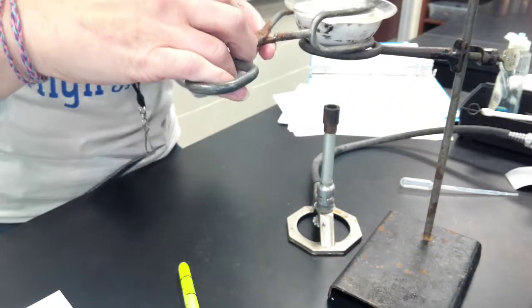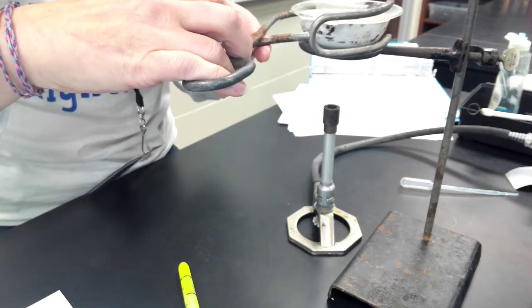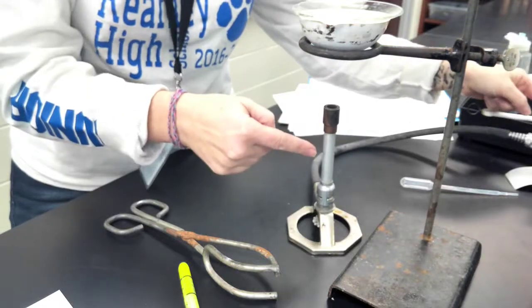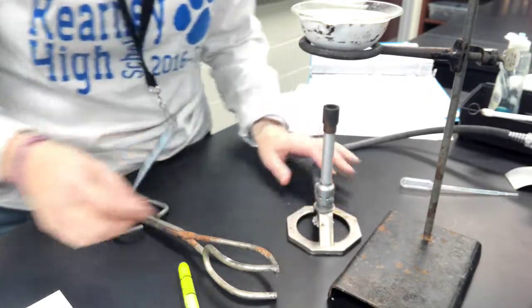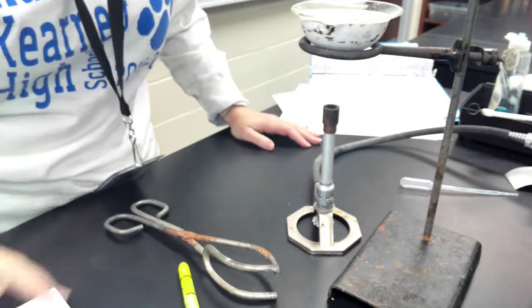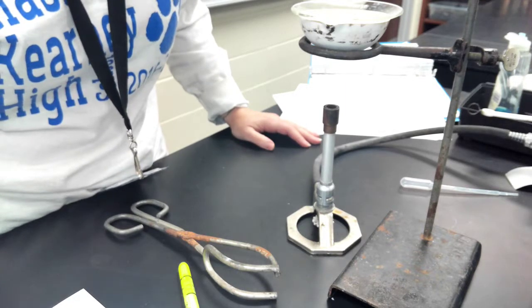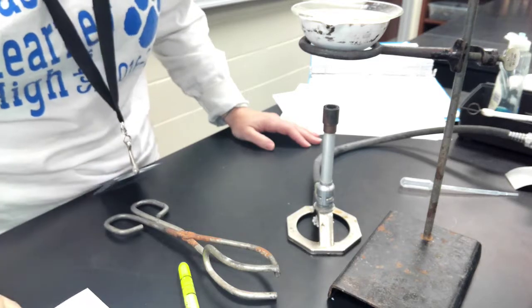If it's cool to the touch and you can move it with your hands, it's fine. I'm going to transfer my evaporating dish back onto my Bunsen burner, relight my flame, and I'm going to heat strongly for 3 minutes. Heat strongly for 3 minutes. It says reheat dish sample watch glass over strong heat for 3 to 5 minutes. So at least 3 minutes.